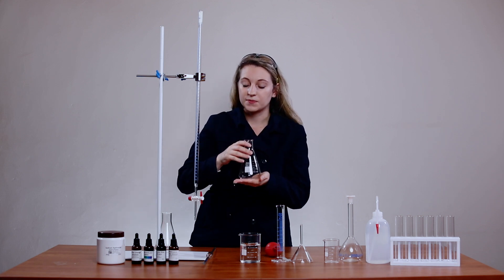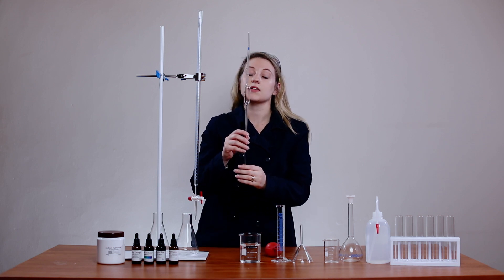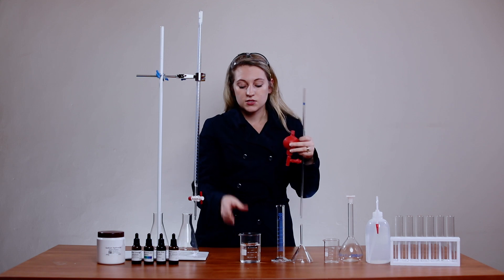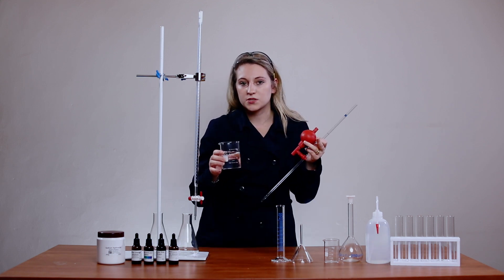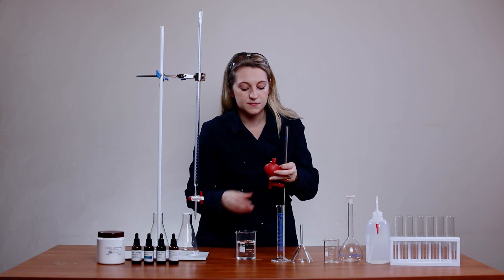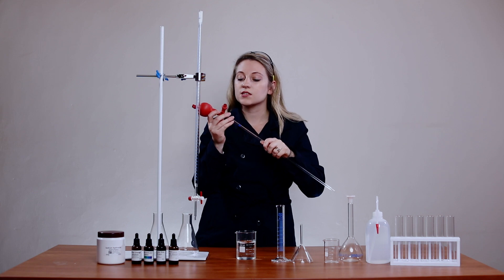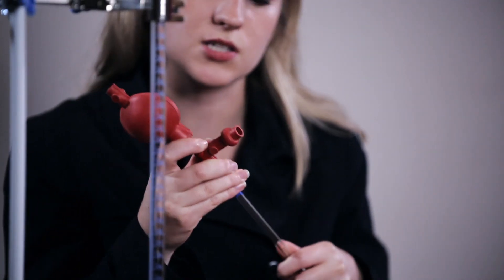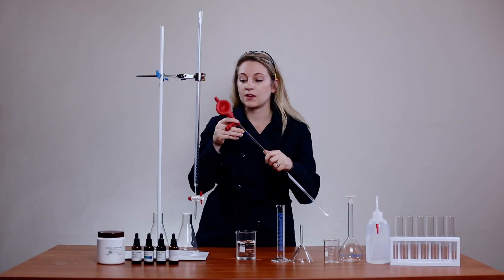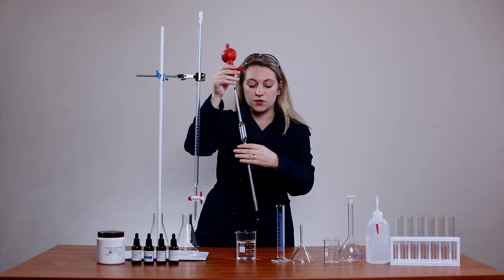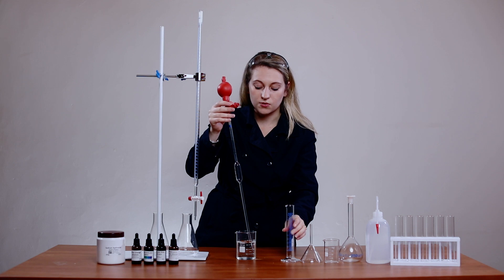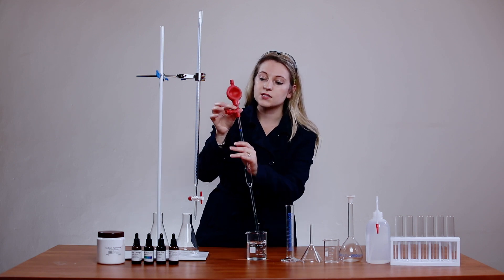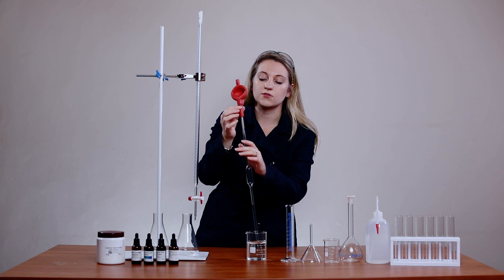Using the pipette I'm going to suck up liquid. In this case I've only used water for purposes of illustration and remember guys if you're working in the lab you always work with distilled water. You're going to put your pipette into your flask and press the suck button on your red pipette filler.